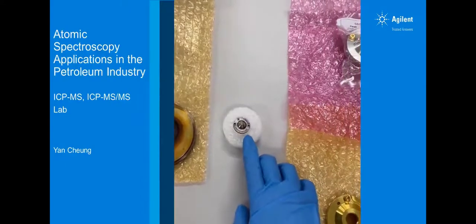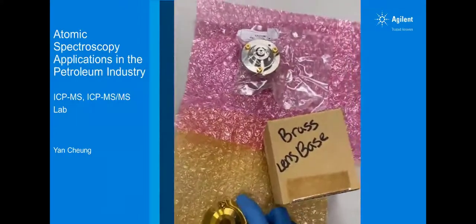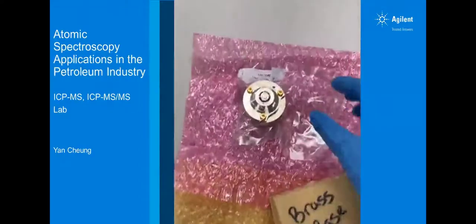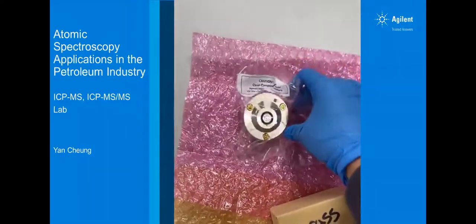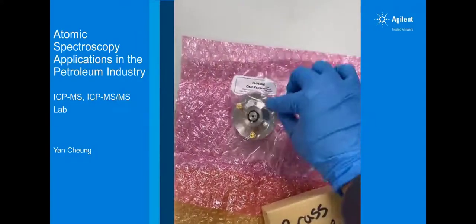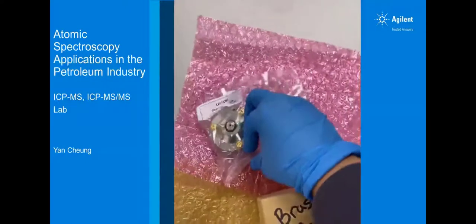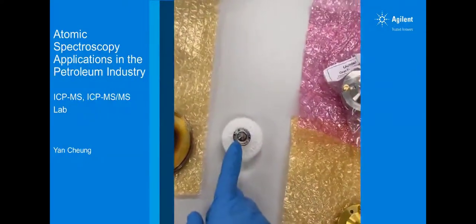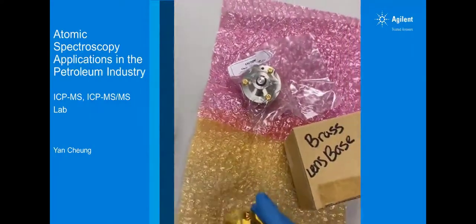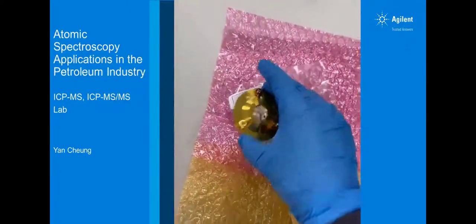If you use a platinum tip for the skimmer cone, we recommend using a brass lens base. So here I'm showing a brass lens base. On top here, I'm showing a brand new X lens that you can purchase from the Agilent store. As you can see, the lens base is stainless steel. So if you are using the skimmer cone with the platinum tip, then you will need to purchase a brass base separately and replace that stainless steel base for the lens stack.